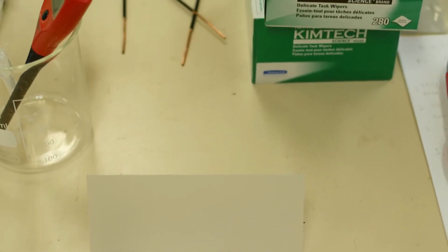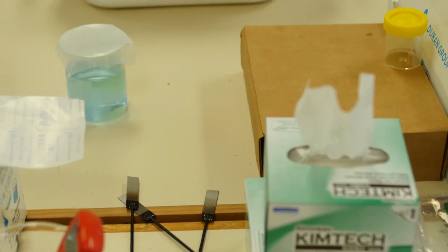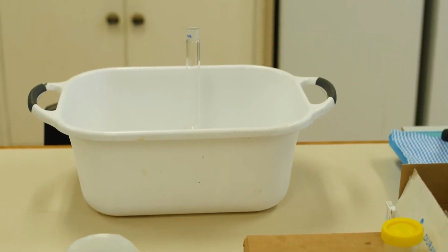Next, the potassium iodide must be transferred into a 500 milliliter volumetric flask. The weighing paper can be used as a funnel to ensure no potassium iodide is spilled.